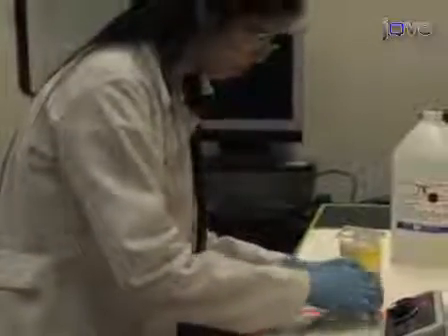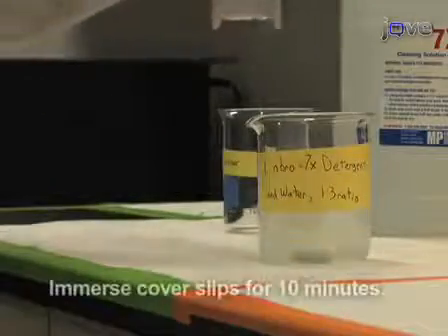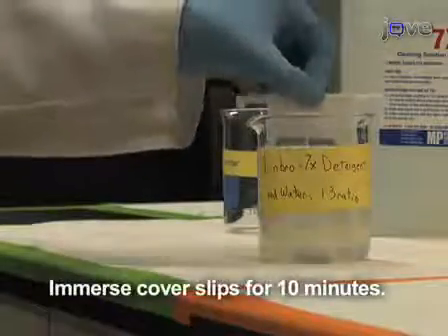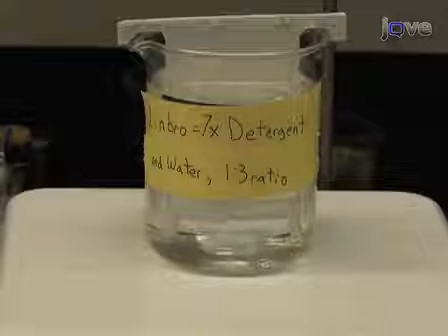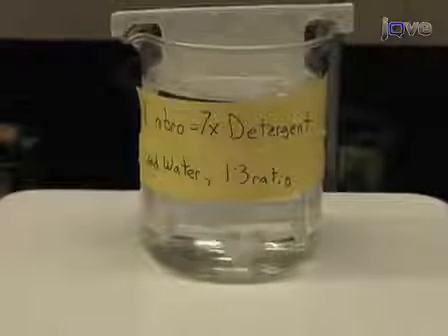For microcontact printing, you should prepare the coverslips and protein solution for stamping several days in advance. First, immerse the coverslips into the Linbro solution for 10 minutes, heating and stirring until the solution is clear. This process, as well as the following steps for cleaning and storage, can be simplified by loading coverslips into ceramic staining racks. Next, extensively rinse the coverslips with deionized water.